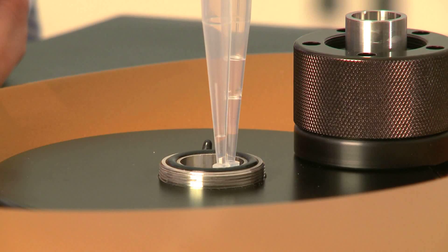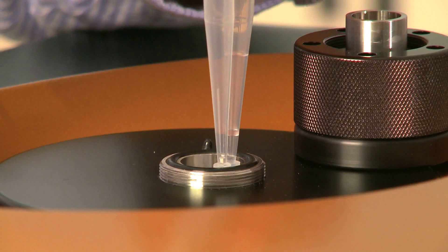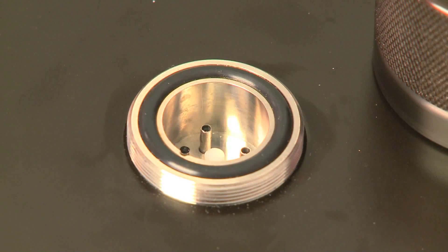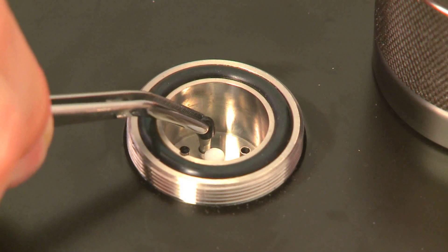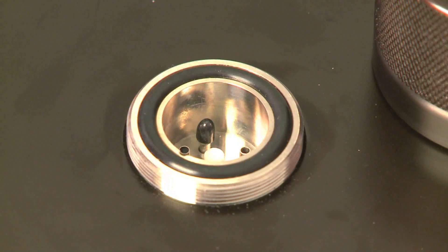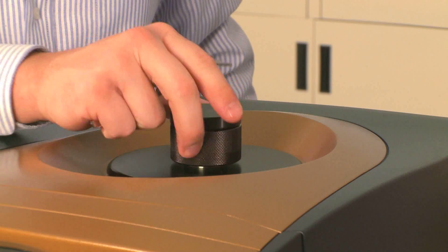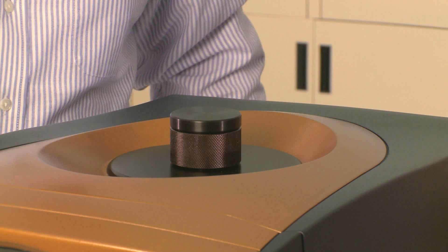We're going to repeat this process for the sample side — now your sample cell is filled and ready for the experiment. Next, put a small black vinyl cap on one side of the cell, then put your pressure cap back on, pressurize through the software, and now you're ready for the experiment.